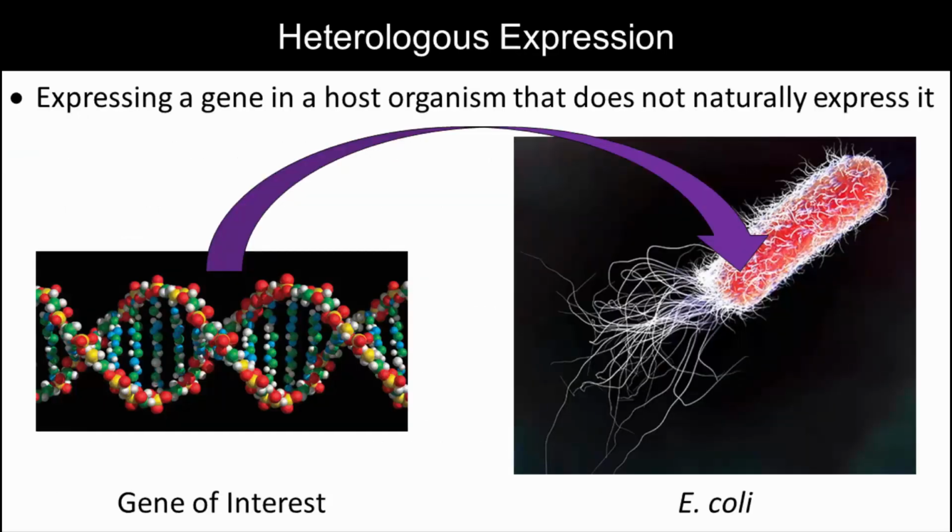Earlier, you selected a gene you want to study. The goal for this unit is to produce a large quantity of the protein encoded by that gene so that you can analyze it and learn about its function. We'll use E. coli bacteria to produce the protein for us, so we need to put your gene of interest into E. coli cells. The first step of that process is making a lot of copies of your gene.